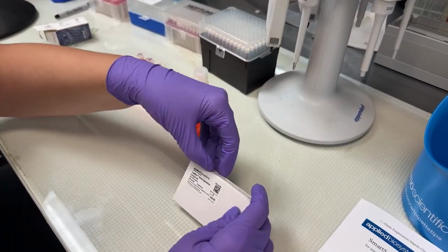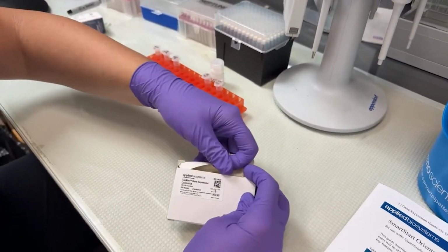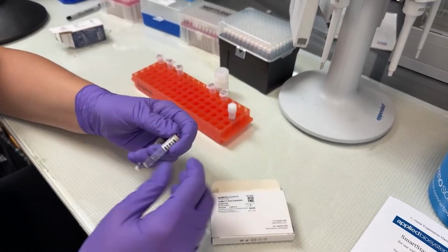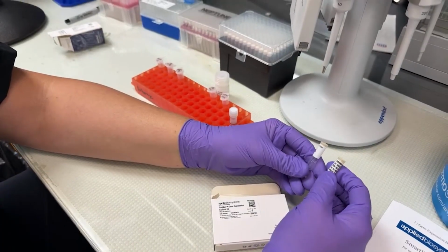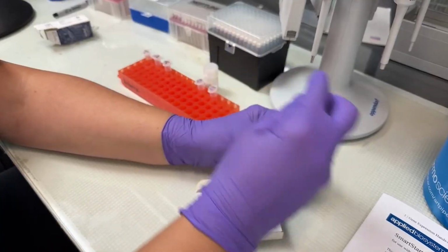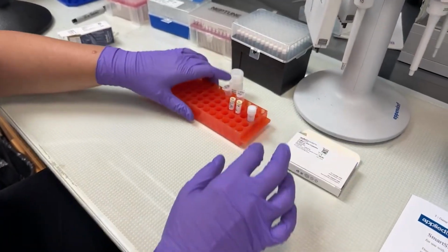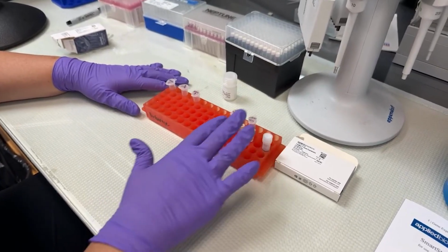Our TaqMan Gene Expression Control Kit comes with 3 items, which I will open for you. That comes with 1 control sample and 2 assays. So we have 18S and a TERT assay, both for human RNA, and then we have our sample of the human RNA. When I first start, I'm going to vortex everything that had been on ice, which were these 3.